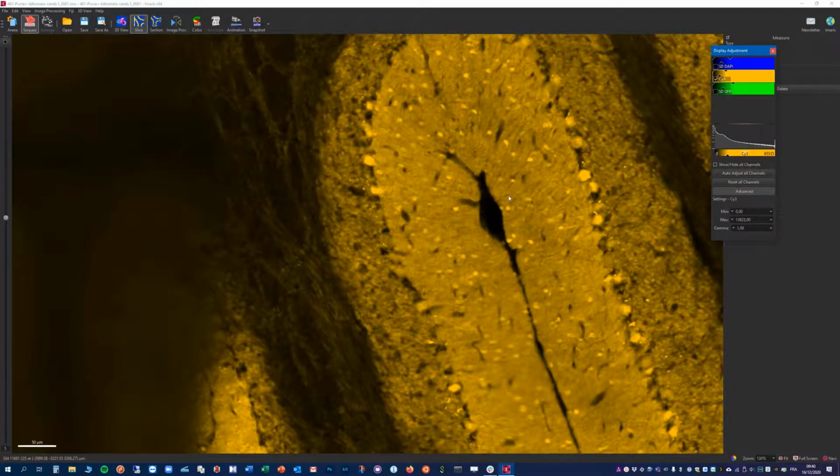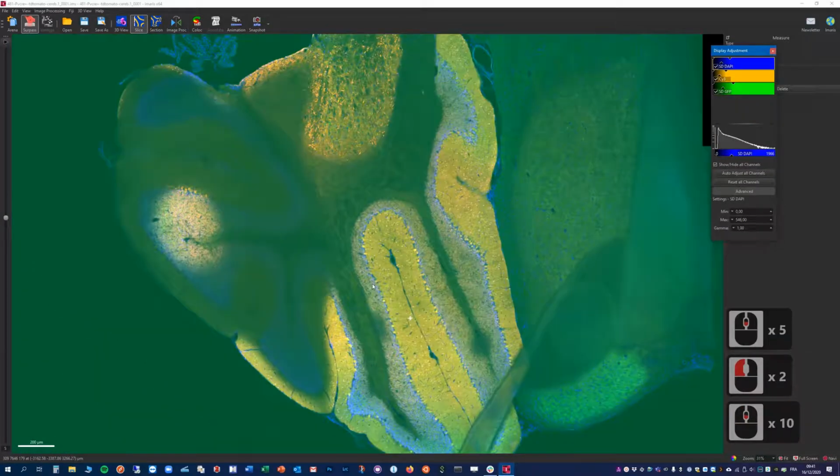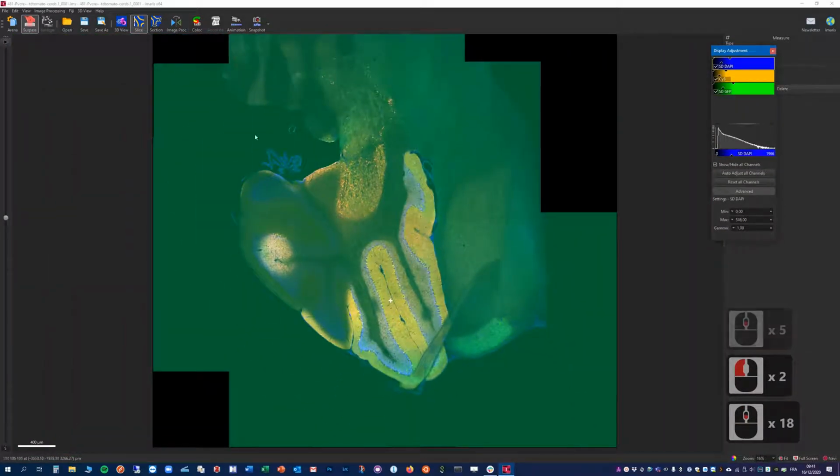So we will do several steps, including cropping, resampling, and defining some masks, and maybe also a bit of filtering to clean up the image. First step, crop the unnecessary area.